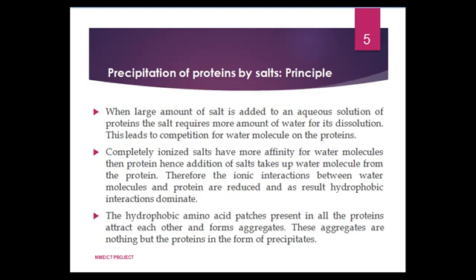This leads to the competition for water molecules on the proteins. Completely ionized salts have more affinity for water molecules than protein. Hence, addition of salts takes up water molecules from the protein.